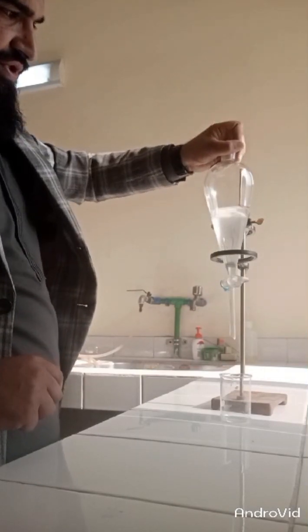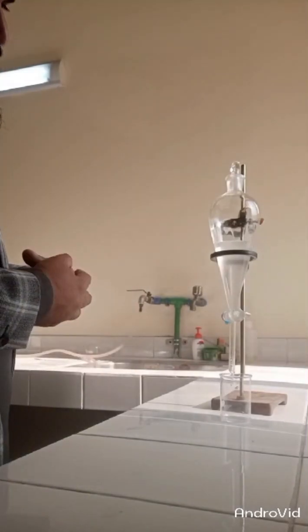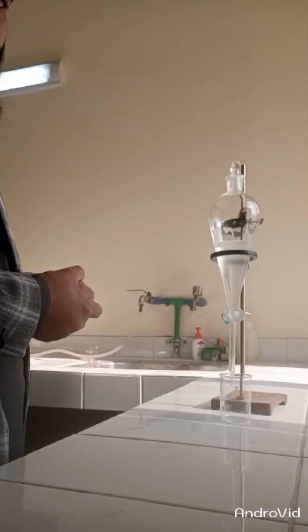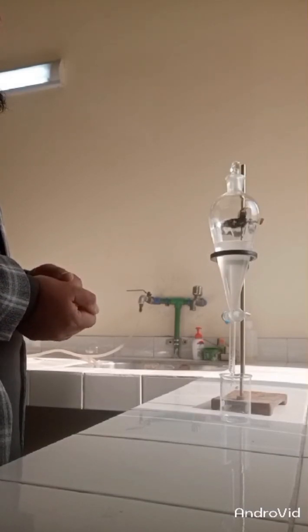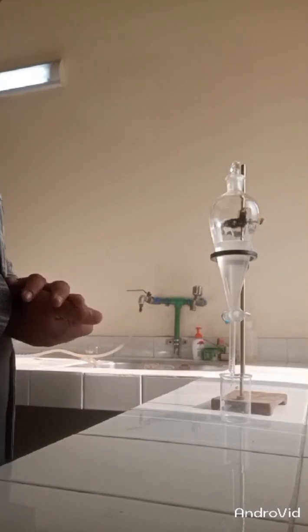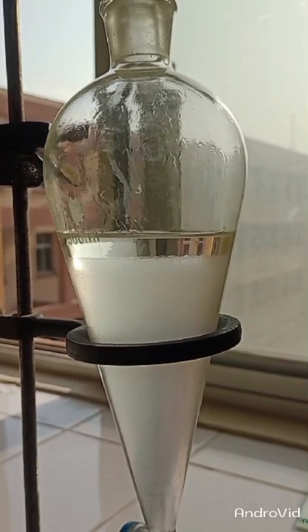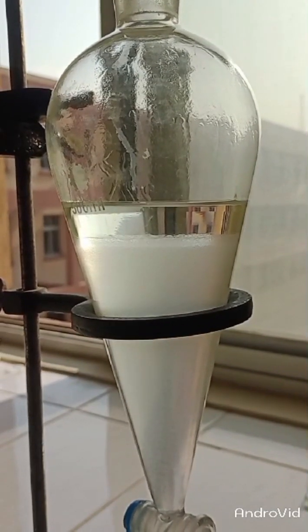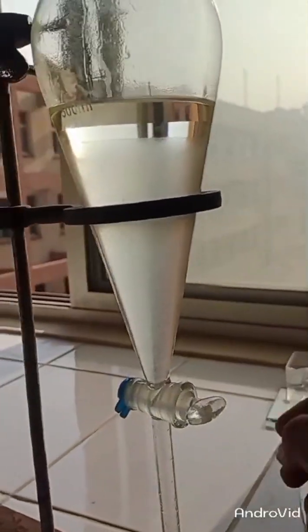Now put this separating funnel in a stationary condition. The aqueous and organic layers will take time to separate from each other. The organic layer will carry all the organic product, and all the acid which was our initial substance will be collected into the aqueous layer. You can now see the separation of layers — the organic layer is being collected at the upper surface, and the aqueous layer below contains all the inorganic impurities.